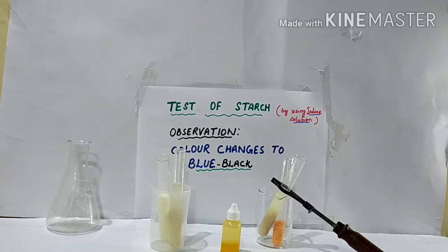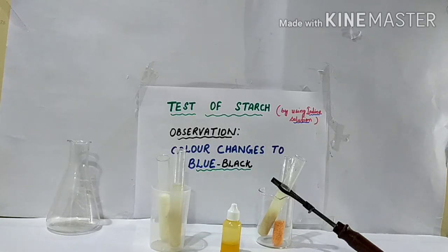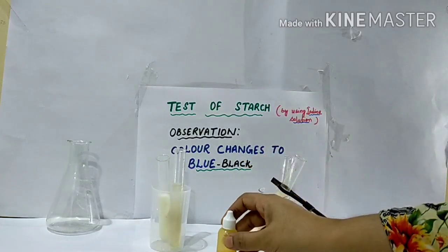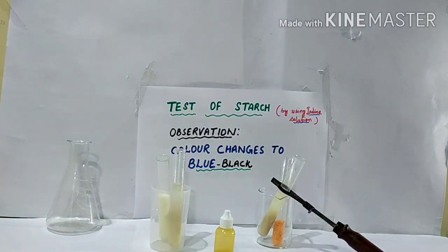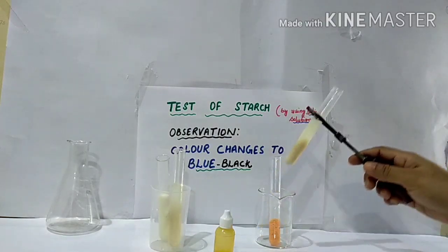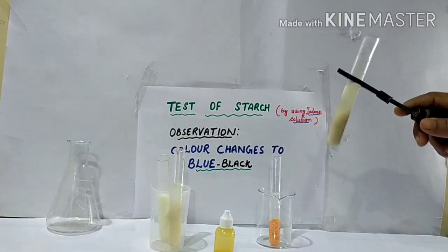Good morning students. Today I am going to show you the presence of starch in food items. To test the presence of starch, we need iodine solution, which I have taken. If the color of the food changes to blue-black, it means that particular substance contains starch. So for the test, I have taken wheat flour.